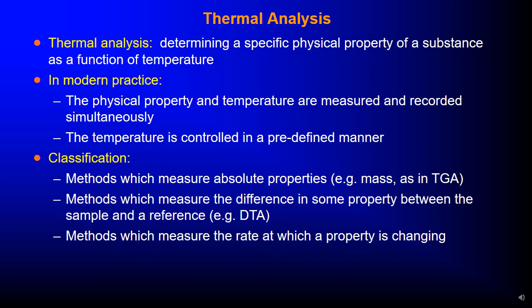So, thermal analysis. Thermal analysis is for determining specific physical properties of a substance as a function of temperature. In modern practice, the physical property and temperature are measured and recorded simultaneously. So the temperature is controlled in a predefined manner.